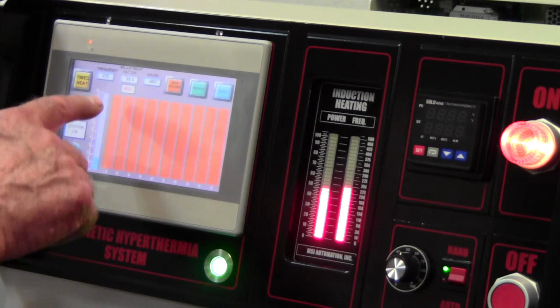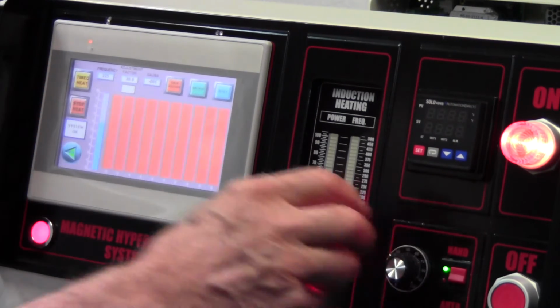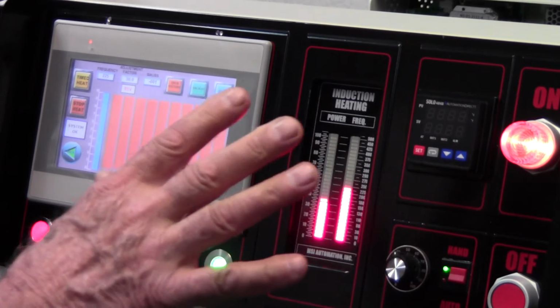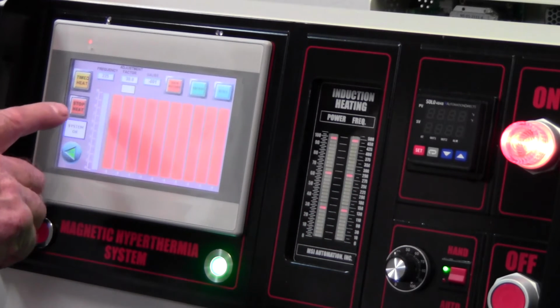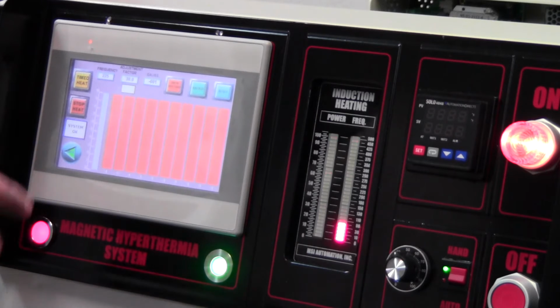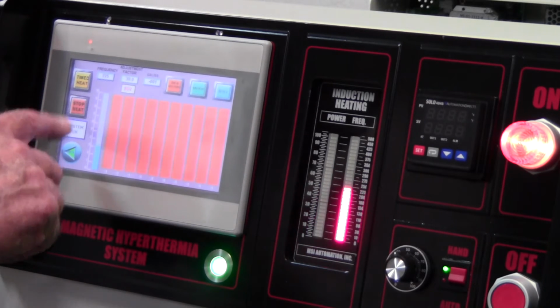So we're going to turn on the timed heat. So now we're running. And you see right there, that little box, you adjust the potentiometer until you get to 85 volts, right there, and leave it. You leave it right there. Okay. That will be the voltage at which we do our measurement. One more time. Turn it on. 85 volts. Good. Stop heat. Okay.